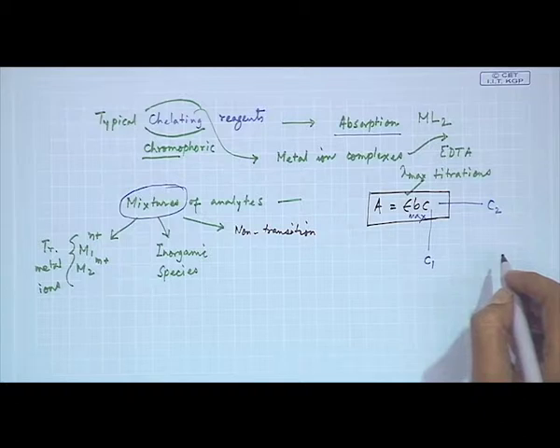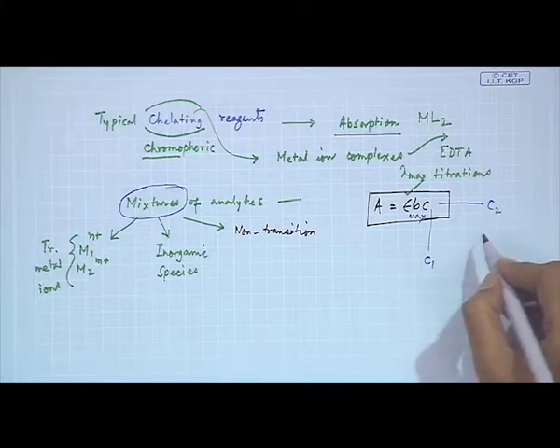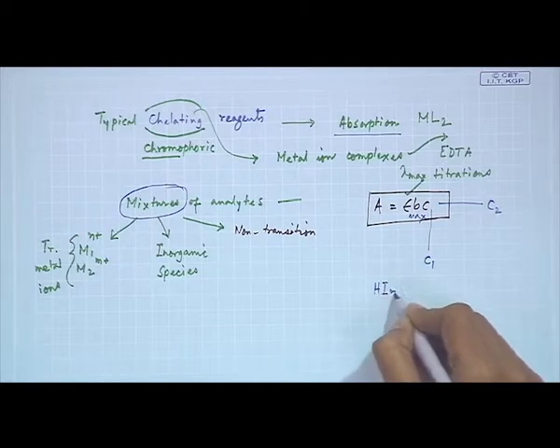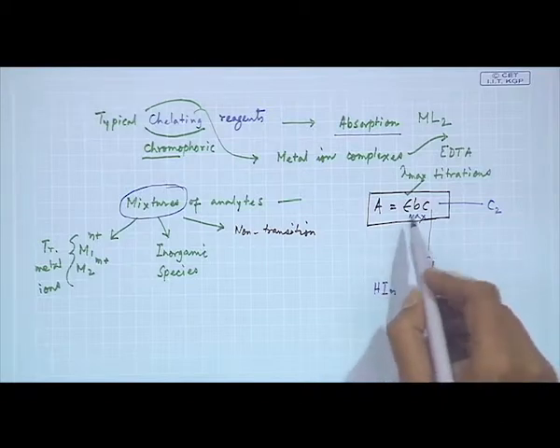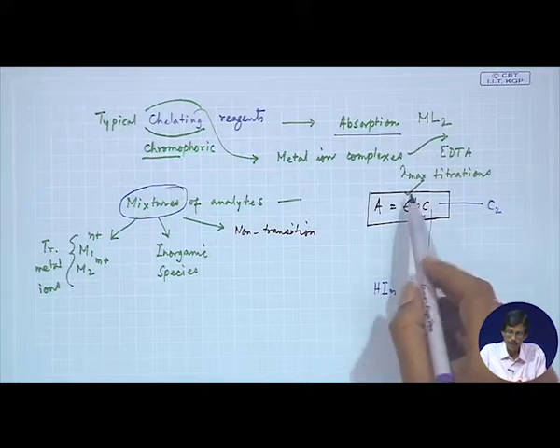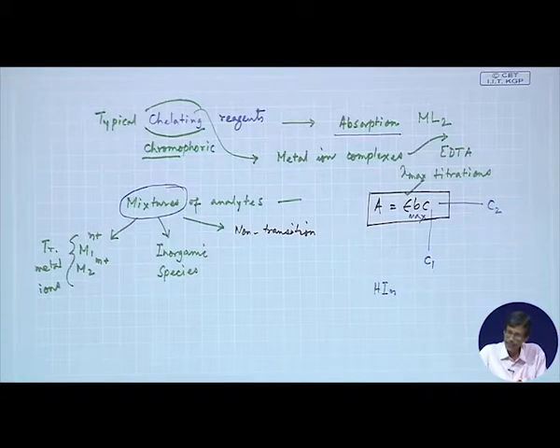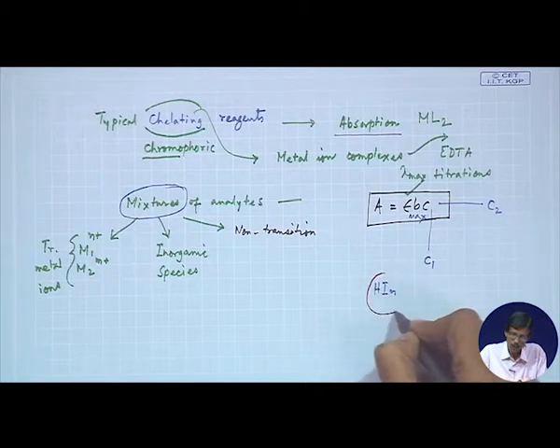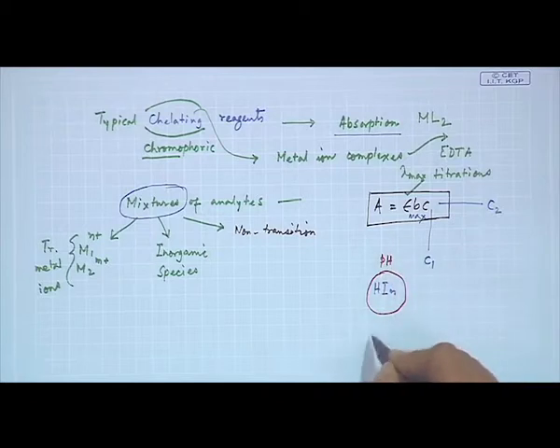And this can also be very much useful if there are two species, such as your indicator, methyl red or methyl orange indicator. So, this is one species, we know where it is absorbing, where it has the corresponding lambda max value and the epsilon max values. And this particular indicator, as we have that knowledge by now, with the change in pH, will change its color.